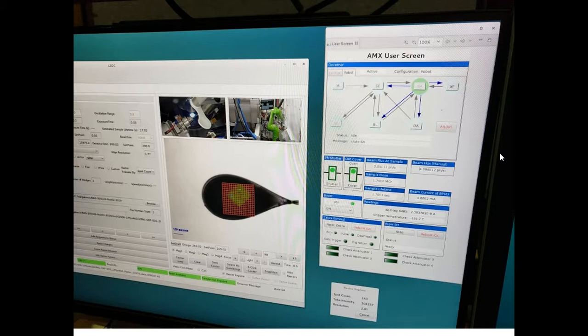But that's it for protein crystallography. I hope this makes sense. The next step we're going to do is we're going to look at JMOL. And JMOL is basically taking the data from a beamline like this, where it's all been processed, and looking at the protein structure. Okay?